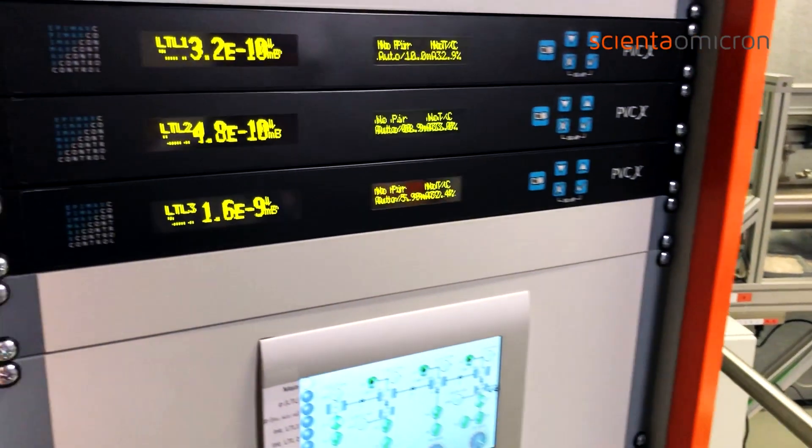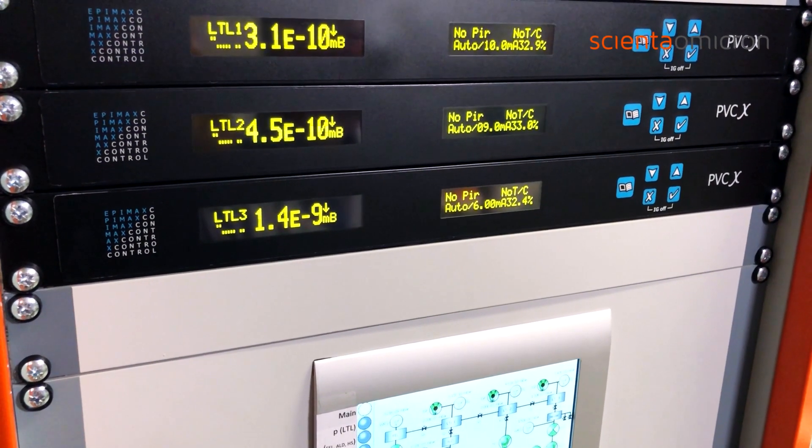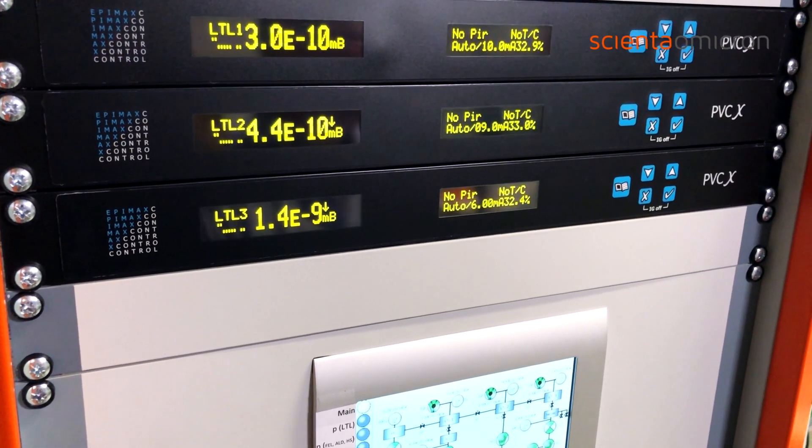Optional motorization integrates convenient control from a tablet PC or the system control touch screen.